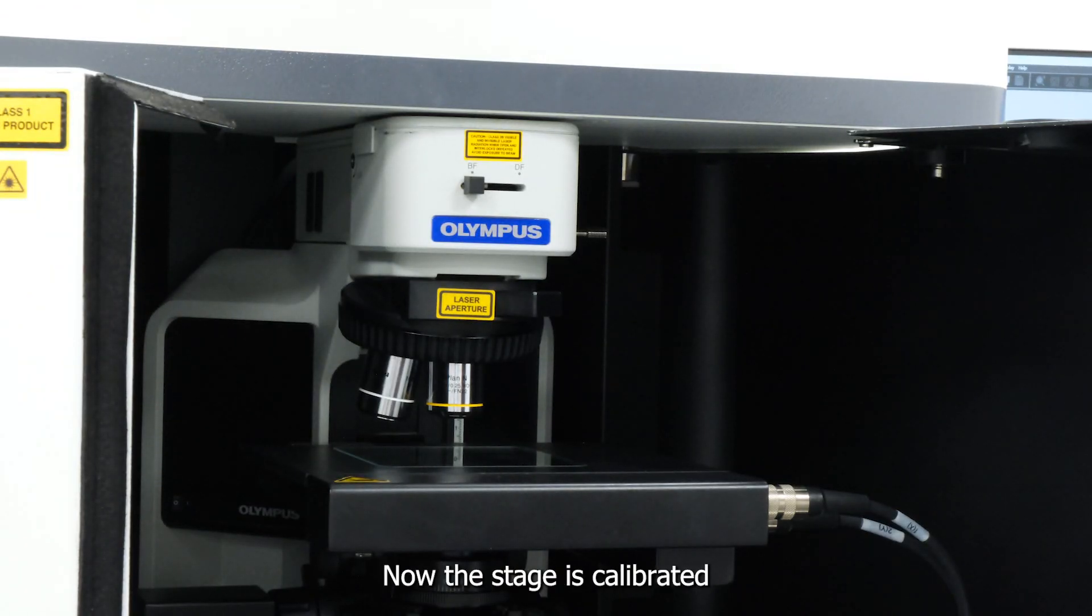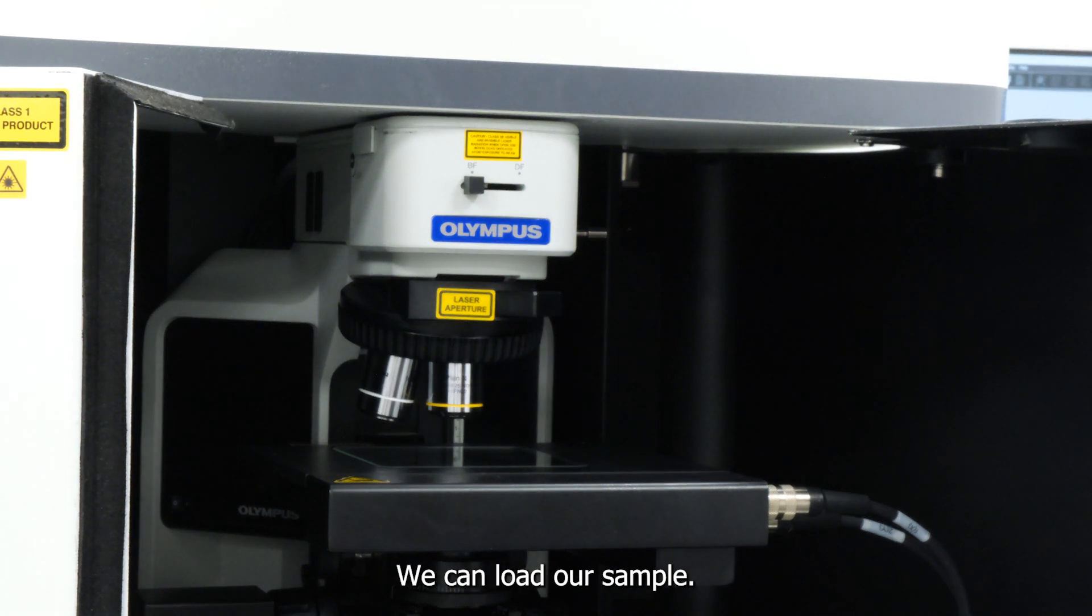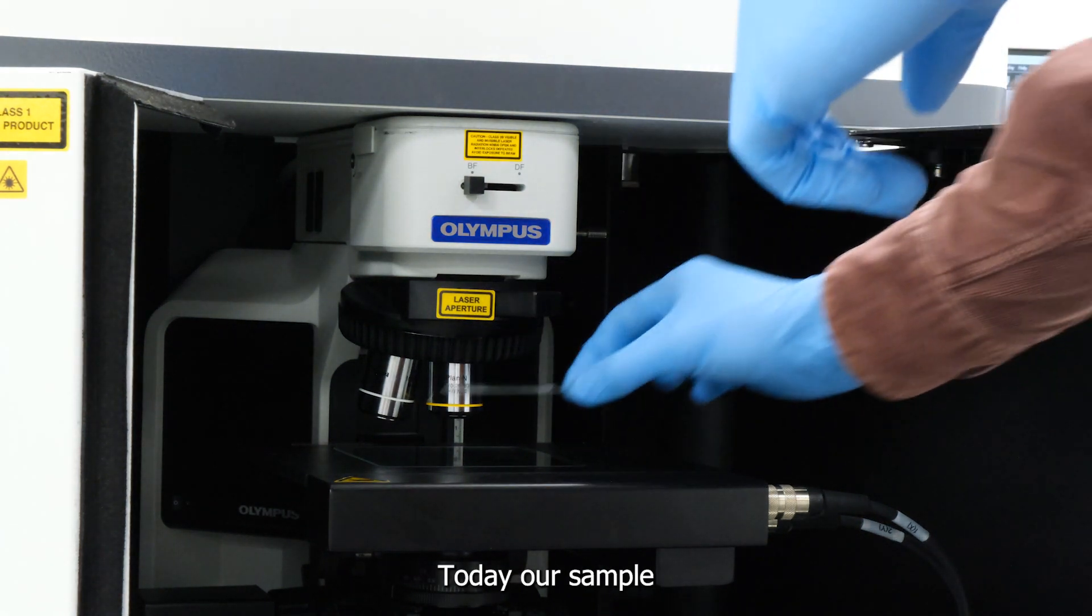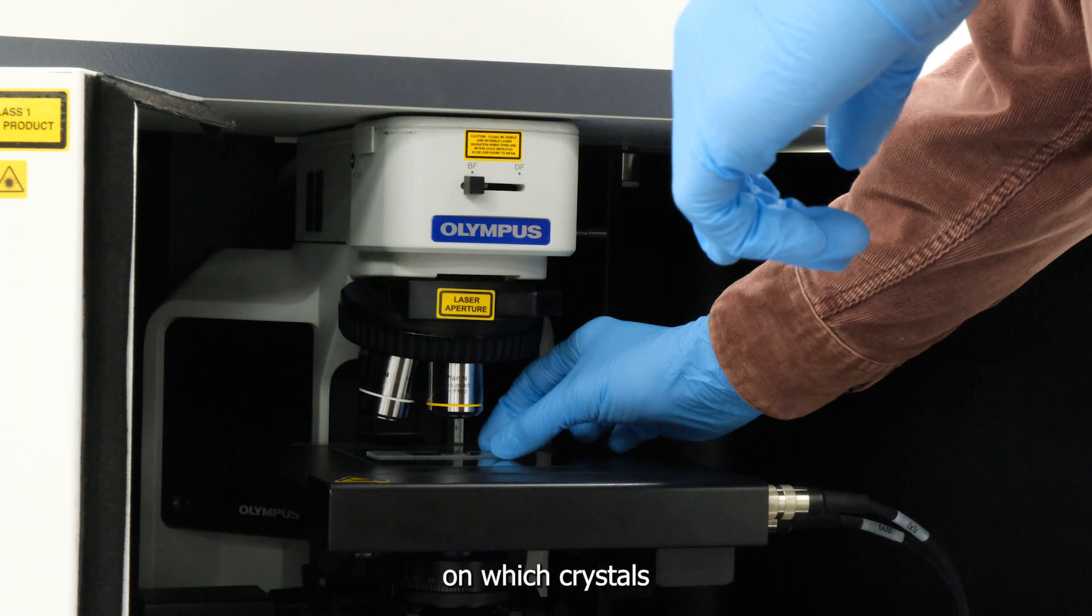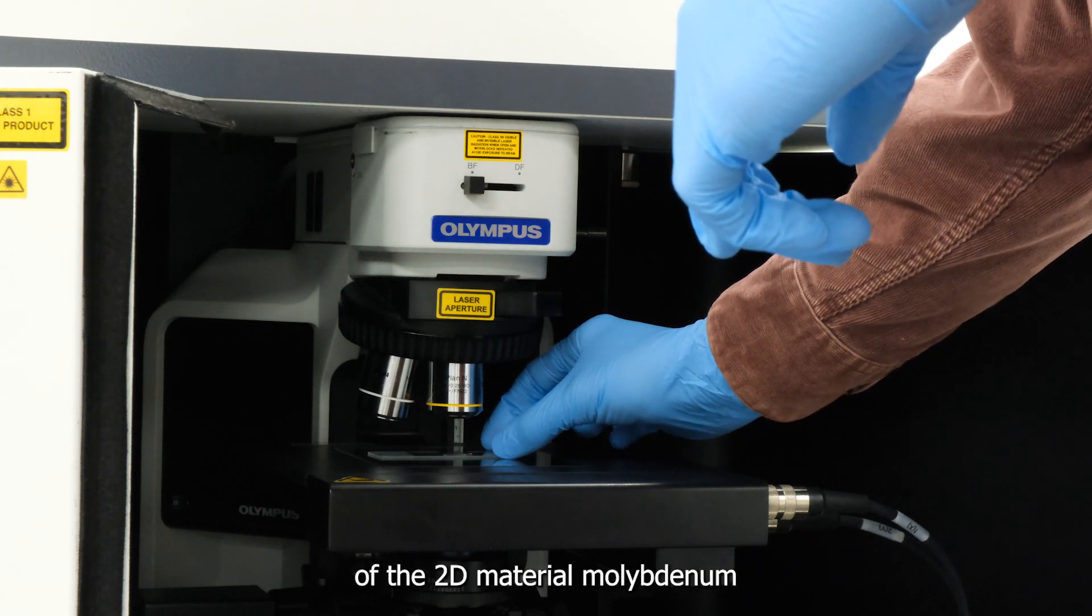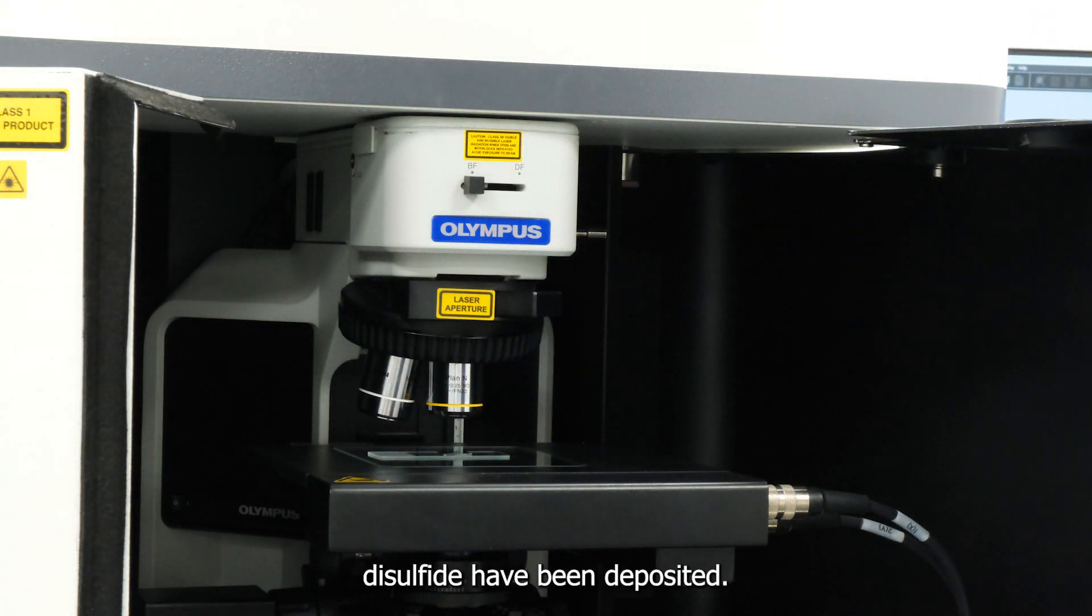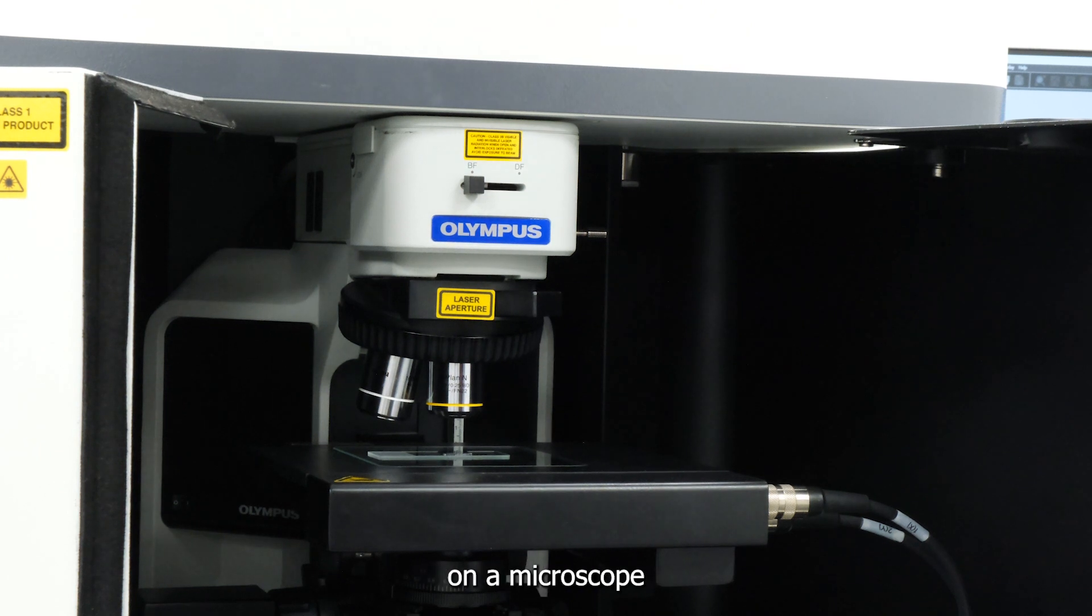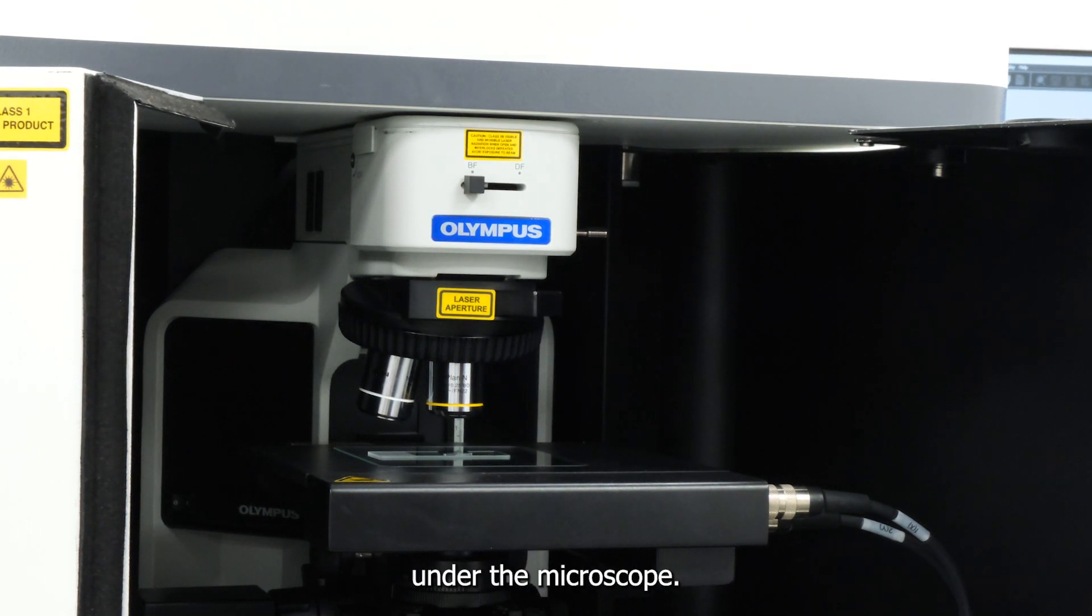Now that the stage is calibrated and ready for mapping, we can load our sample. Today, our sample is a silicon wafer on which crystals of the 2D material molybdenum disulfide have been deposited. The sample is placed on a microscope slide and loaded onto the stage under the microscope.